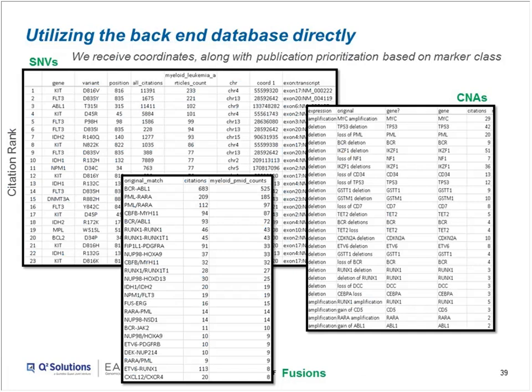So this isn't just a gene. As you see here in the top left for SNVs with KIT, you're also seeing the biomarker, the D816V, as being highly active. You have other ones here in FLT3 and IDH, NPM1, things that I knew right away circulated to the top, and specifically the markers, so that if I really wanted to make a tiny panel, I could actually focus only on those genes should a client need something like that. But given something like AML, SNVs and indels are only a tiny part of the story.